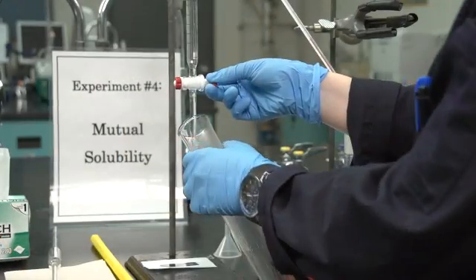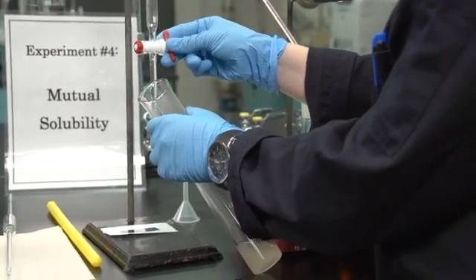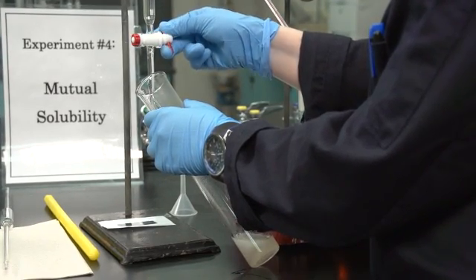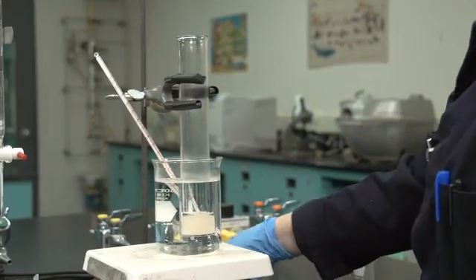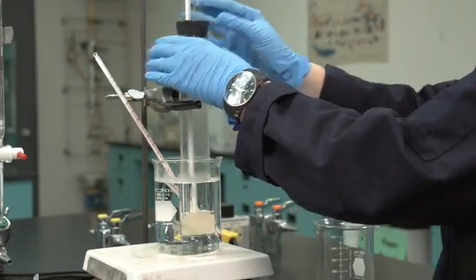From the burette, add 3 mils of distilled water to the freezing tube. Remember to record the volume of water added to two decimal places as read off the burette. Heat and cool the mixture again to determine the cloudy to clear and clear to cloudy temperatures.